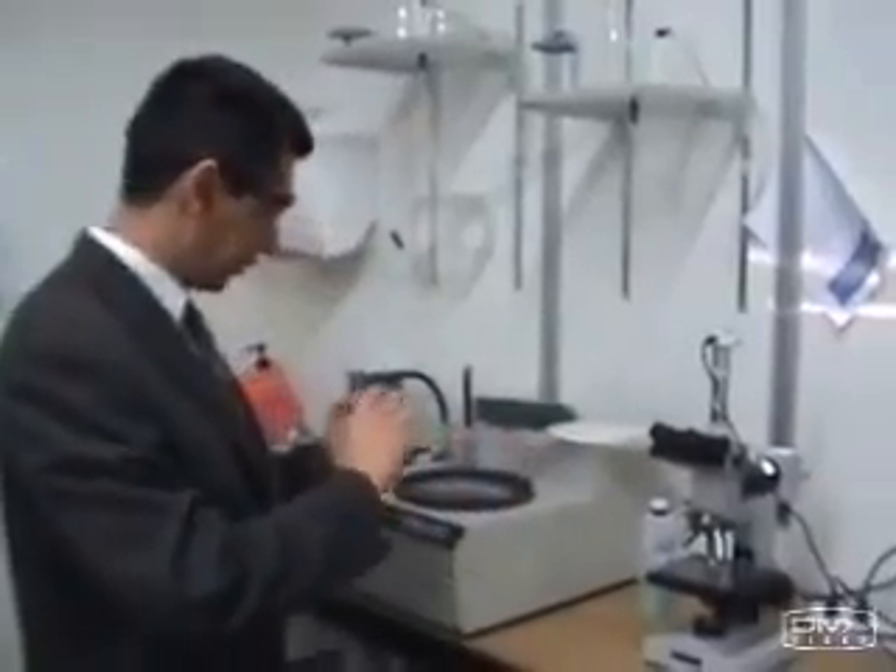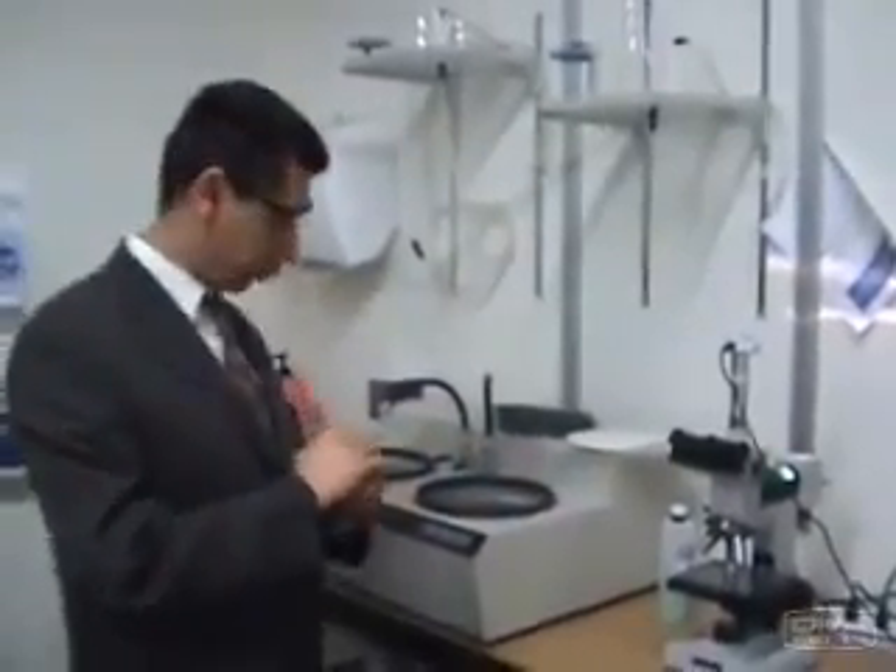Hi, my name is Dr. Ray Taheri. Today we are here to have a quick presentation on how to polish and edge samples. First of all, I would like to give you a little brief of how to use microscopes.